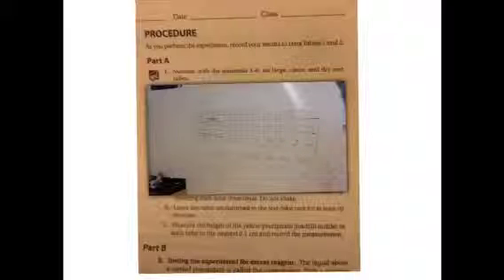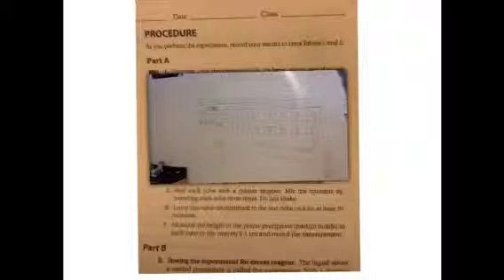So we filled the first test tube with 1 mL of Pb(NO3)2 and 8 mL of NaI, and then we did the second with 2 of Pb(NO3)2 and 7. If we just examine the table, we can see what we did there. And then after we did this, I will show you videos of what the actual experiment looked like. Just having some technical difficulties getting them to overlap and watch videos at the same time.